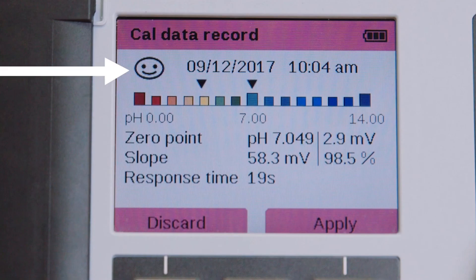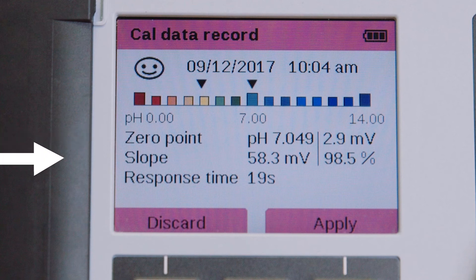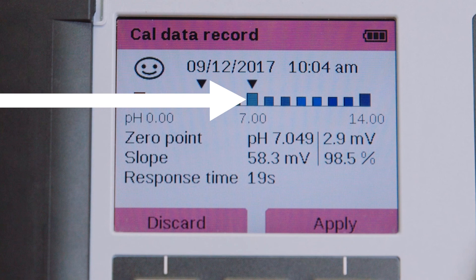Once the process is finalized, the Portavo provides a summary of the results of the calibration. In the top left corner, there is a smiley face indicating that our calibration is good. The specific values of the calibration are also indicated: the zero point, the slope, and the response time of our sensor. There is also a pictograph above these values indicating the two points used during our calibration procedure — you can see the arrows indicating the buffer values of 4 and 7 that were used.